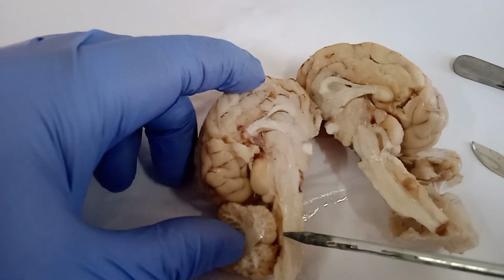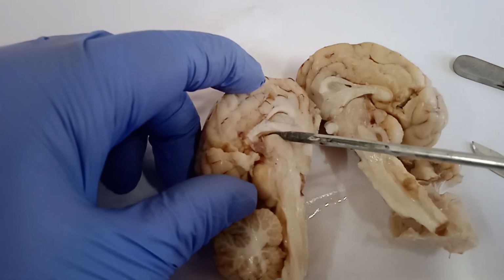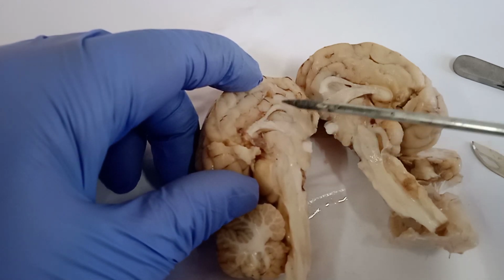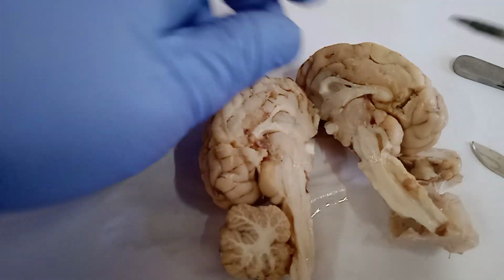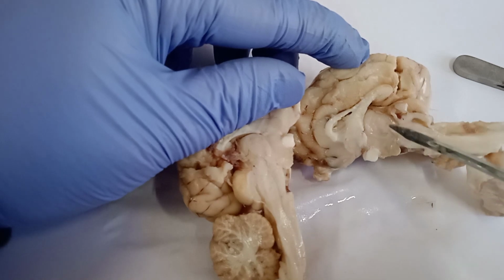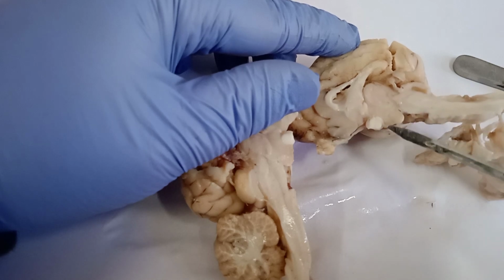And underneath this, here will be the fourth ventricle. So the fourth ventricle will be here. The third ventricle will be here. And this is the lateral ventricle. This is the area of the corpus callosum, how they are joined, the corpus callosum part here. Likewise here in this also, see here, this is the lateral ventricle, this is the thalamus, and this is the area called the hypothalamus, because underneath the thalamus is the hypothalamus.